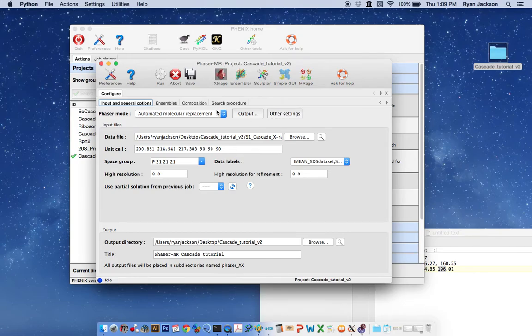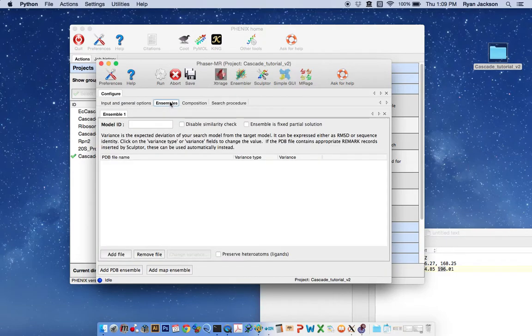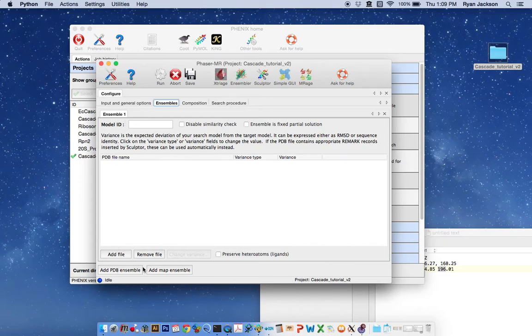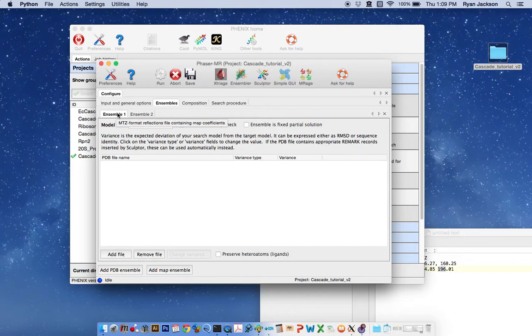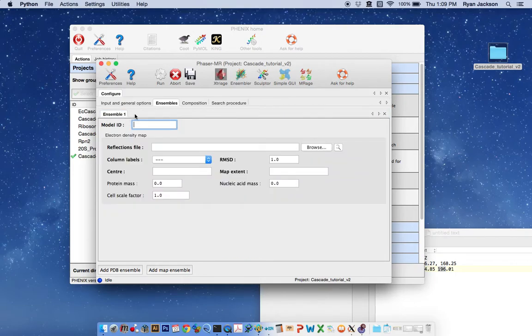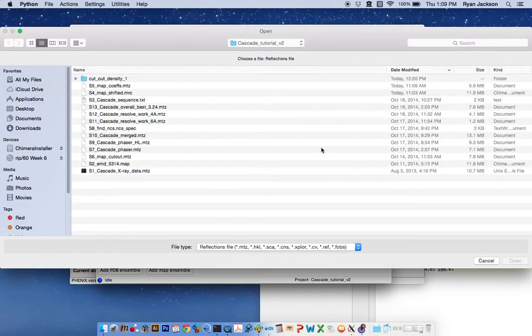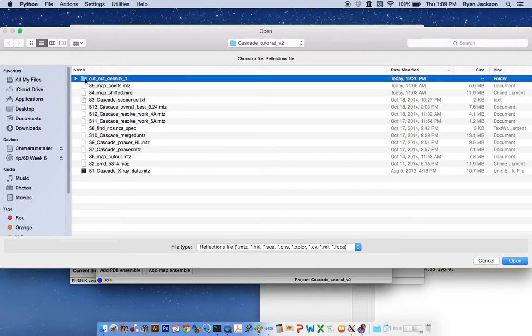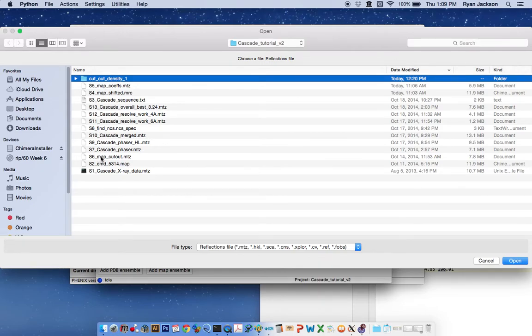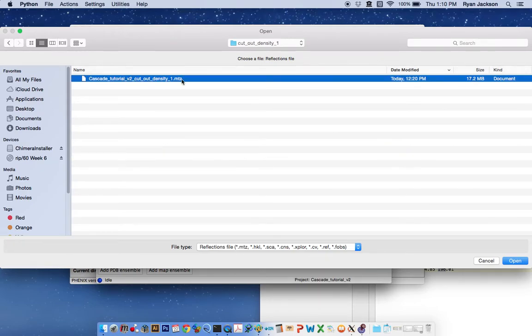Now we're going to set up and run phaser. To do this we need to build an ensemble. This is an ensemble for a PDB, we actually want to add a map ensemble. So we'll remove ensemble 1 and work with the newly made map ensemble. We'll call this cascade_em. The reflections file is what we just prepared in tutorial number 1. We have provided that for you as supplemental file 6. I'm going to use the one that we just did in tutorial 1.